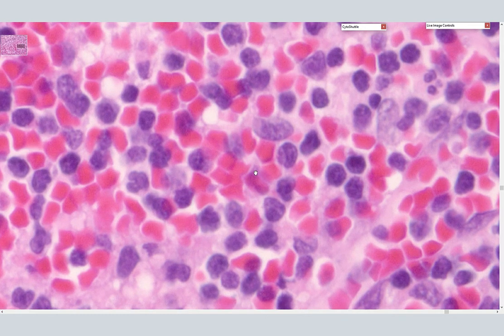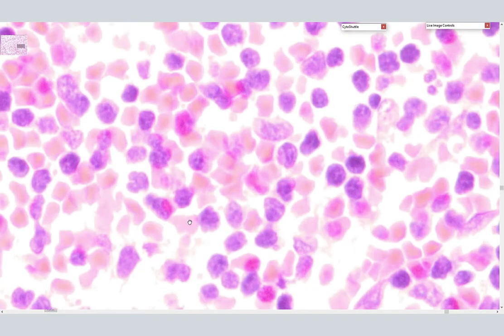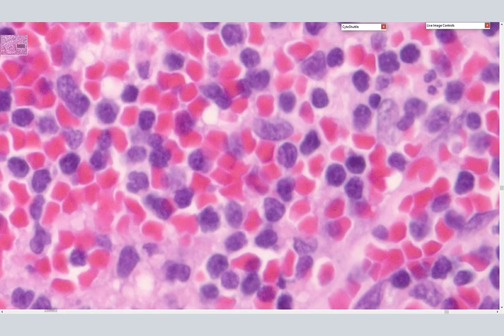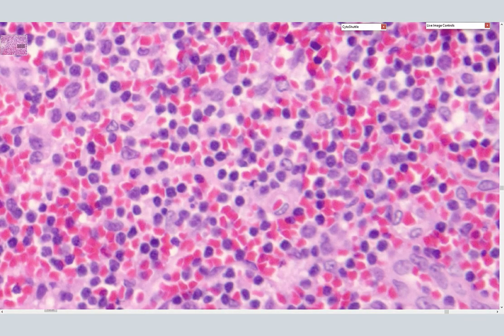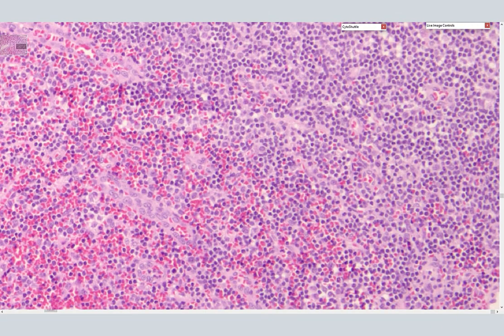The other thing is I'm holding down on buttons on my mouse, and you can see I can adjust the brightness, and then I'll just click down on the scroll wheel, and I go back into auto exposure. I'm going to swap out objectives. You can see how quickly it adjusted its brightness. And so the brightness is always keeping up with me. And then that's at the low power focus. Okay, so I'm going to go back up to 40x.